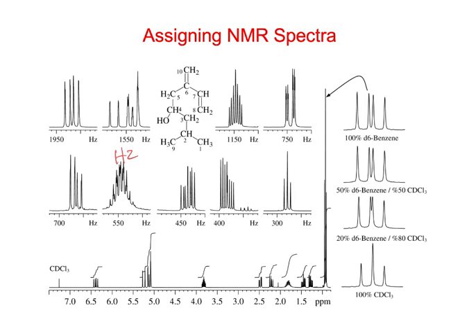Well, we're expecting those 3 to be the highest chemical shift, right? Well, one of these, I would say there's 2 on this end, there's 2 on this end. Those are more similar to one another than this one that has more substitution. So you're saying at 1550 hertz.